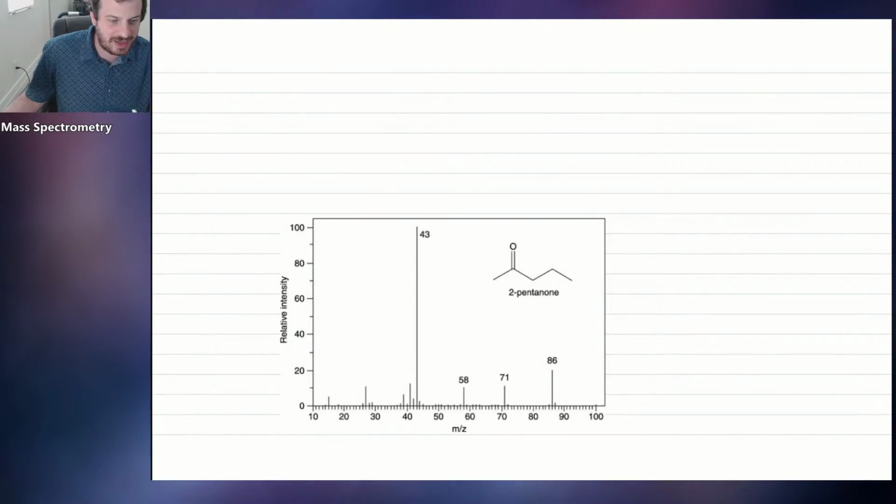And the reason is that you can imagine how we typically weigh objects. We usually put them on a scale, which is comprised of a spring. The object pushes down on the spring, and based on how much push that object gives, we can figure out how heavy the object is. But that's never going to work for an organic molecule. They're way too small. But with mass spectrometry, we can actually determine how much an individual molecule weighs. Let me show you how it works.